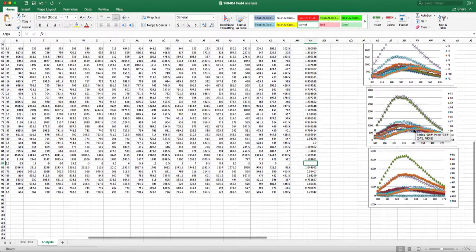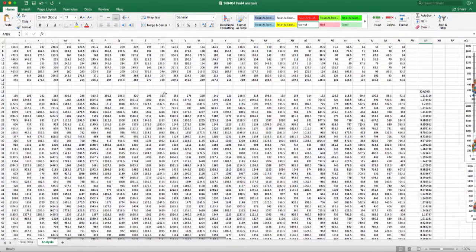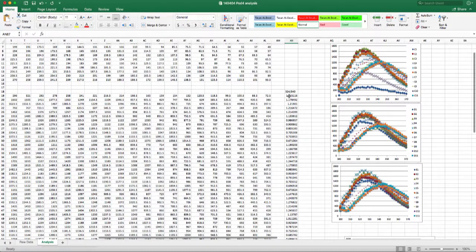All the other mutant curves seemed fine, but there was one wild type one, remember, that also seemed to have no or very little protein compared to the others. So that was the value in C1 right here. So I'm also going to remove that.